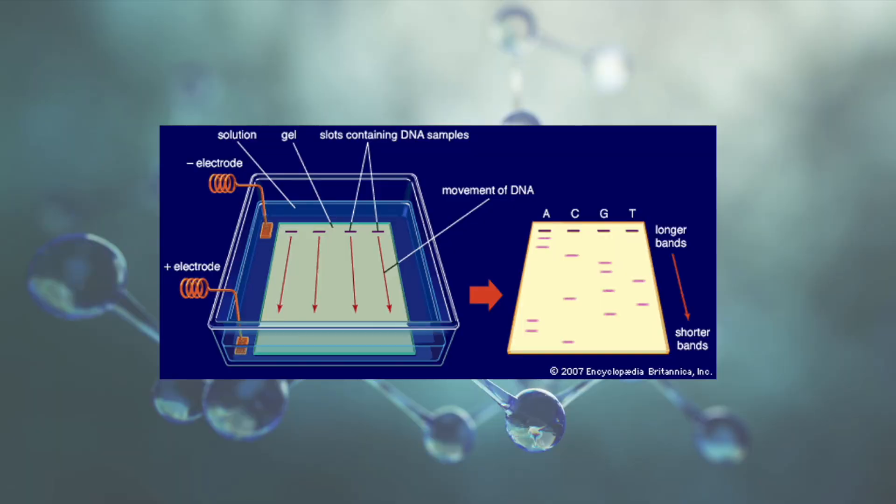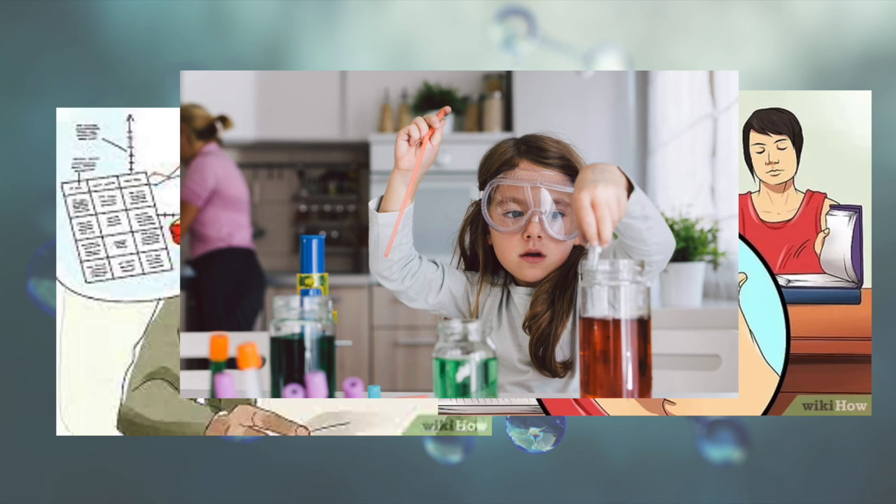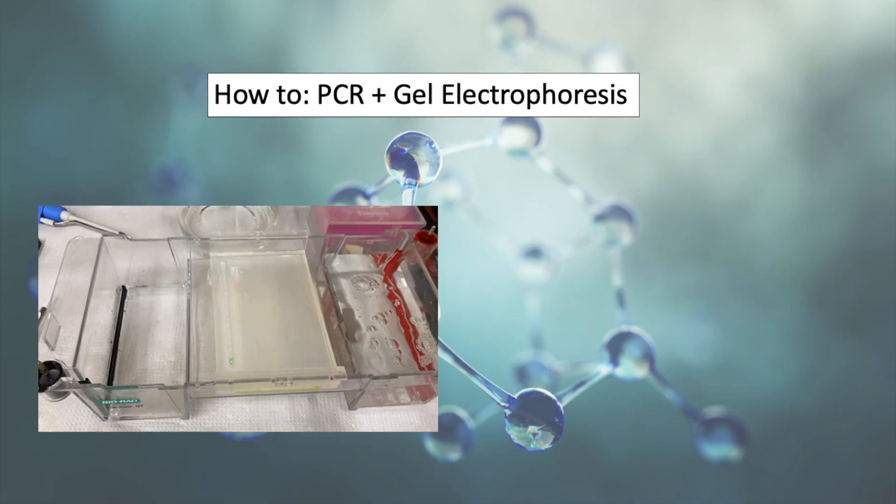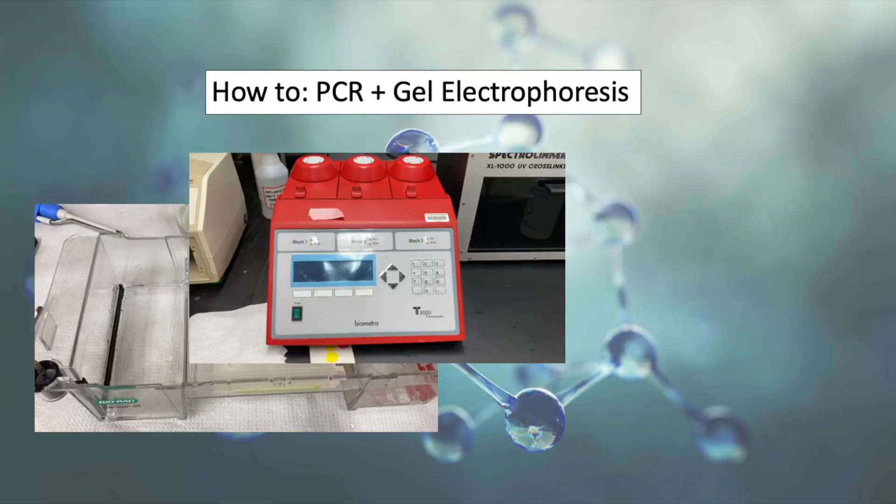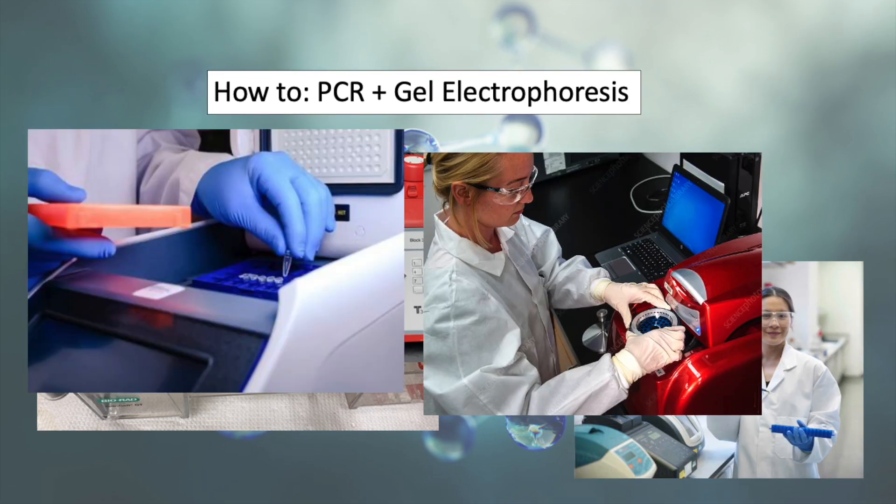That being said, it is still an incredibly complex and intimidating procedure, especially for a new scientist. So today I wanted to go through my process of doing gel electrophoresis, but note that every scientist does it in a slightly different way depending on their equipment.